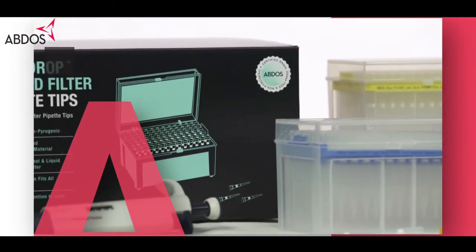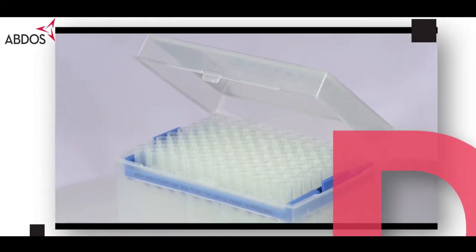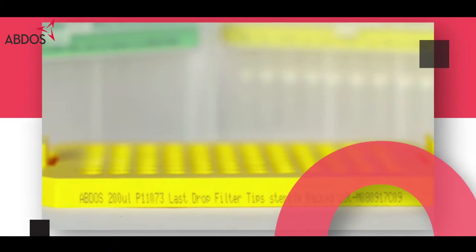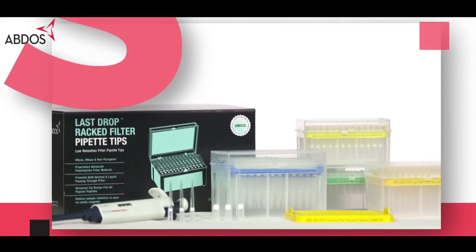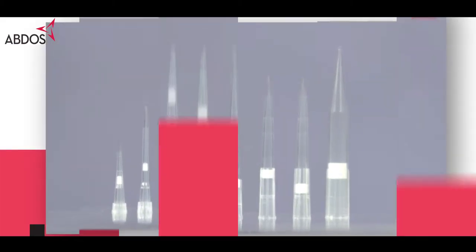ABDOS specializes in liquid handling tools and techniques. We offer a wide range of pipette tips, low retention pipette tips, filter pipette tips, and low retention filter pipette tips in multiple configurations.